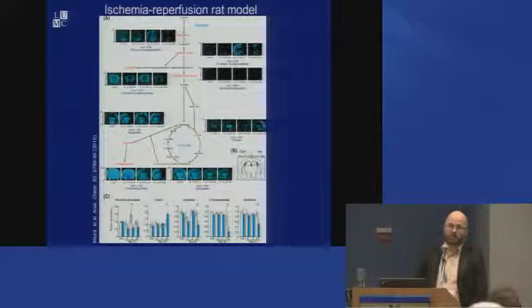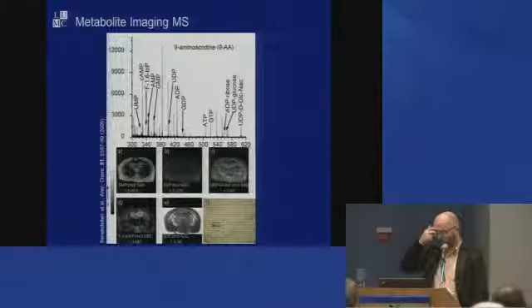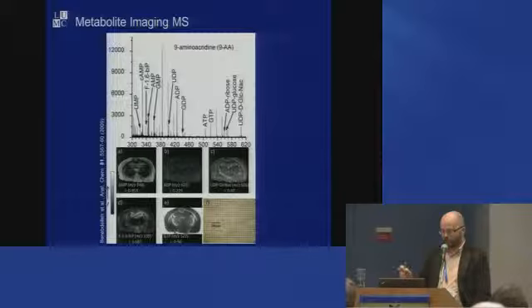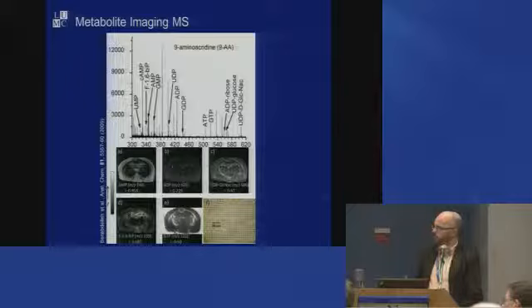I want to talk about metabolites because I see this as a growth area of imaging mass spectrometry, especially when you consider yesterday's release of a very nice Nature Methods paper on imaging mass cytometry. If you haven't read it, I strongly advise you to. So metabolite imaging MS, not looking at proteins now, looking at metabolites. First published by the lab of Olivier Laprévote.